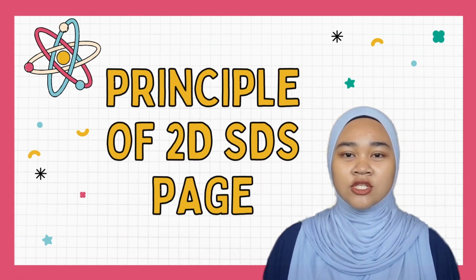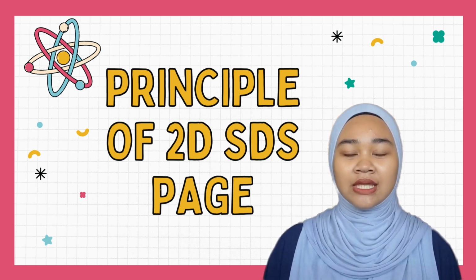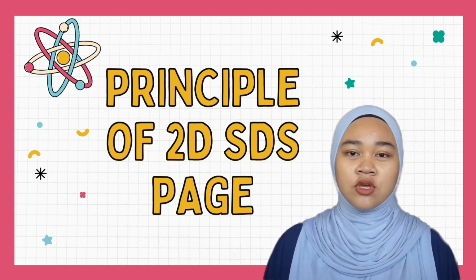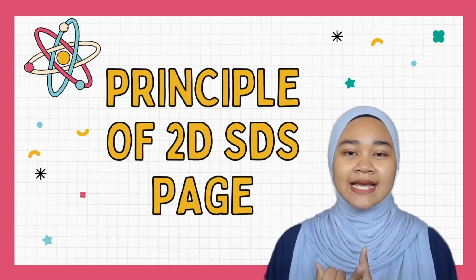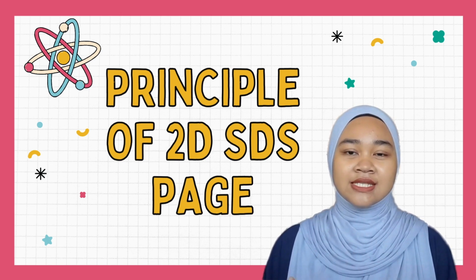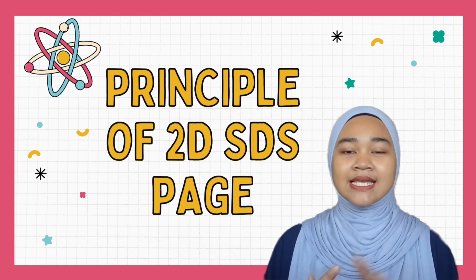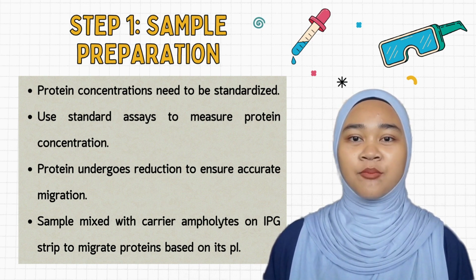Now, let's move on to the protocol for 2D gel electrophoresis in separating proteins. There are 4 steps, which are sample preparation, first dimension separation by isoelectric focusing or IEF, second dimension separation by gel electrophoresis, and staining. Let's take a look at the first step, which is sample preparation.